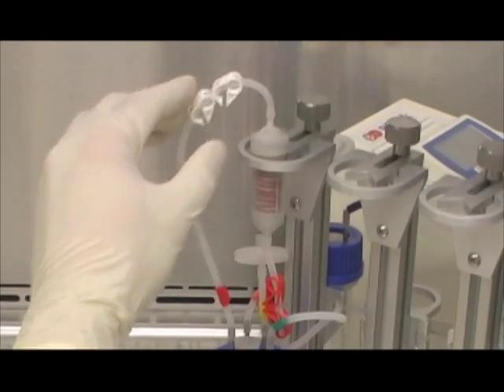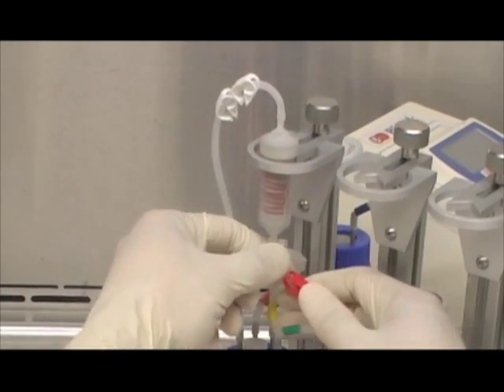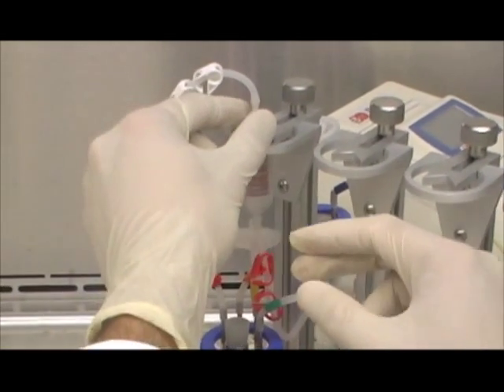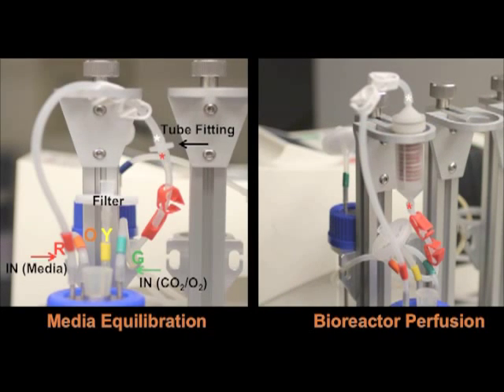Make sure to unclip the red and white plastic tubing stoppers before running the 3D perfusion bioreactor. The following image shows a comparison between the bioreactor prior to media equilibration and 3D perfusion: the media perfusion loop is connected by the large plastic fitting between the red and white tubing stoppers on the left. In preparation for 3D perfusion, the large plastic stopper is replaced by the seeded bioreactor chamber seen on the right.